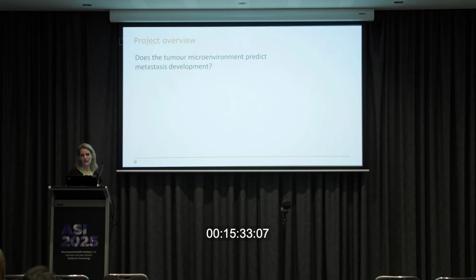I worked 6.5 years in a core facility at the Centre for Microscopy, Characterization Analysis at UWA, where I did a lot of flow cytometry and microscopy. And when I came across to the research group with St John's, it seemed to fit quite well to move into the imaging cytometry space as well. I also should note that when I first saw the scattergrams that Rupert presented, I was a bit sceptical as a flow cytometrist, but they're incredibly powerful and very useful, and they work very well.